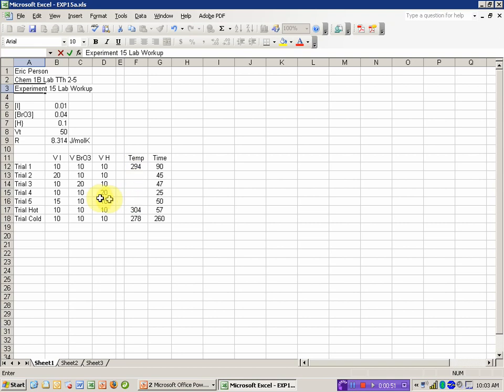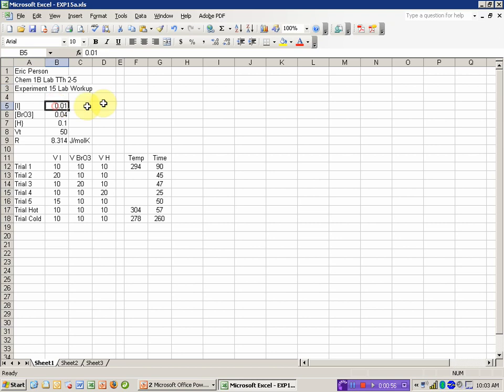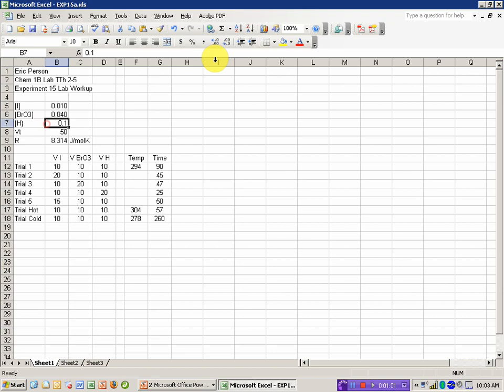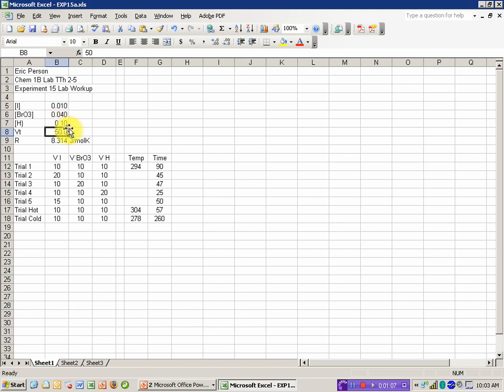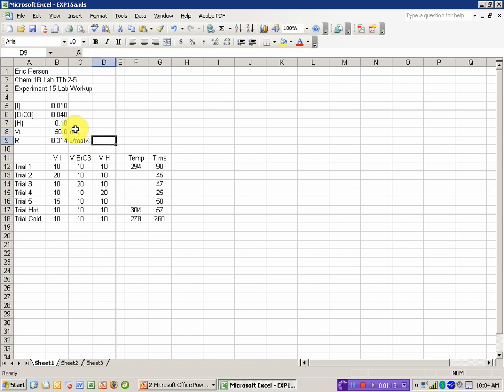I want to start by correcting sig figs. Excel tends to just show the last non-zero digit, but if I look at the concentrations in my notes, I have an extra zero on the end of each of these, and I think my accuracy in using the graduated cylinder goes to one decimal place in the number of milliliters. The other thing to notice here is that I'm putting units in a separate cell from the number. If you put the units in the cell with the number, then you can't use them in calculations.